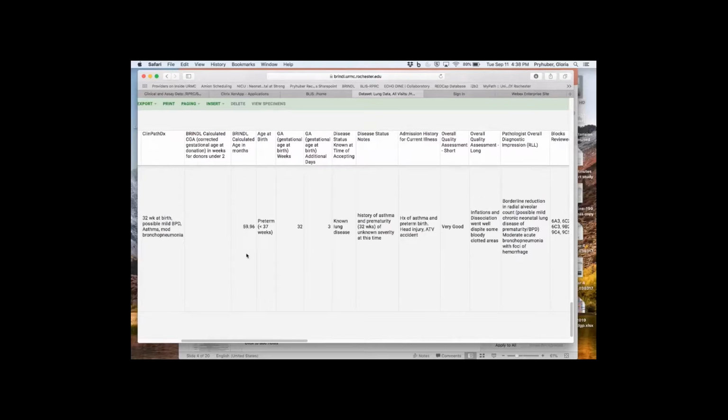So what I would want to do off of something like this, where you can approach it by so many different levels of single cell analysis and validational molecular histology, is prioritize, given all of this information, what would be a potentially interesting group to get genetics on.